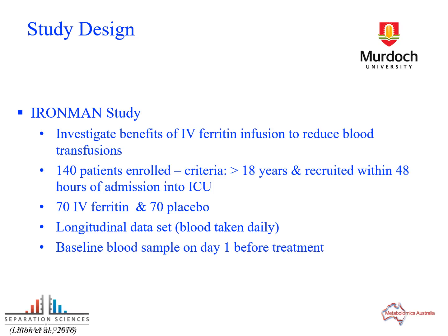So far we've also done reverse phase positive ion analysis of all of these samples. And they come to of the order of 650 with all of the time points. So it's actually a very rich data set from that perspective, for which we'll have not only hepcidin 25, but all of the isoforms of hepcidin, as well as reversed phase data, lipid data, and HILIC data.